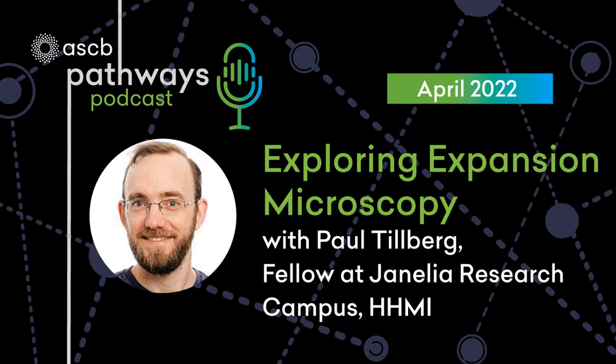Today, we'll be learning about expansion microscopy, a technique of sample preparation that helps researchers to create higher resolution images of cells and tissues using regular light microscopy. Our guest is Paul Tillberg, who is a Janelia Fellow at the Howard Hughes Medical Institute's Janelia Research Campus in Ashburn, Virginia. Thanks for joining me today, Dr. Tillberg. Thank you, Mary. It's great to be with you.